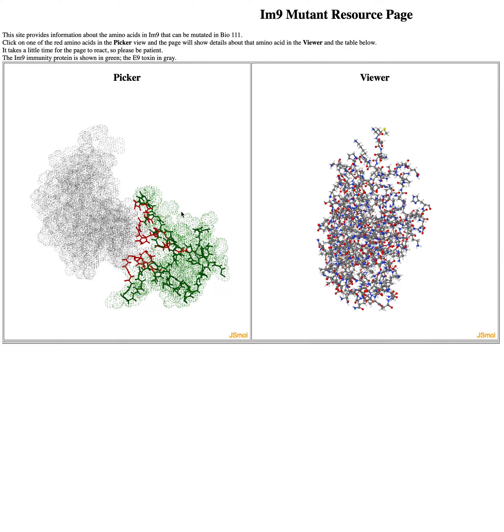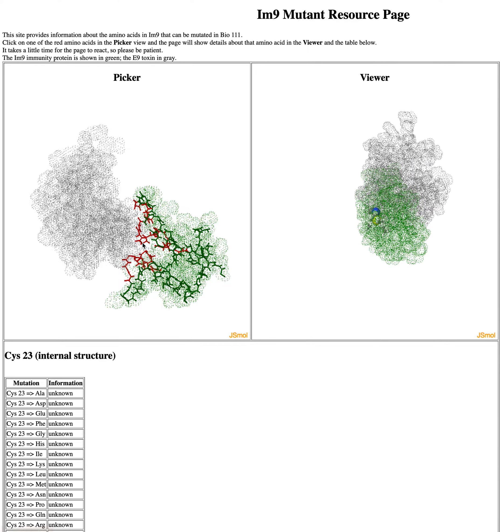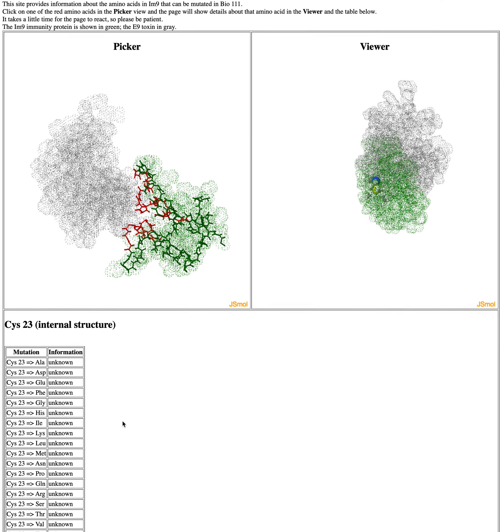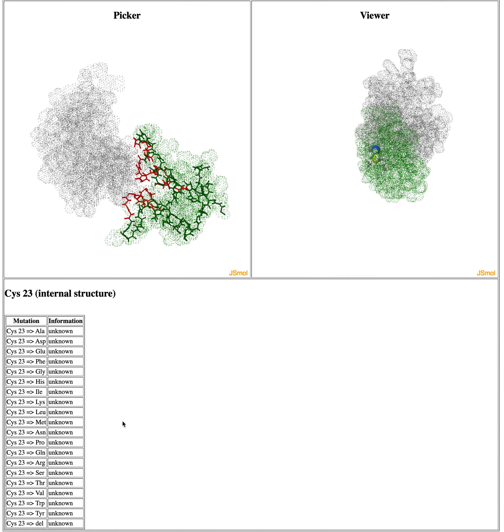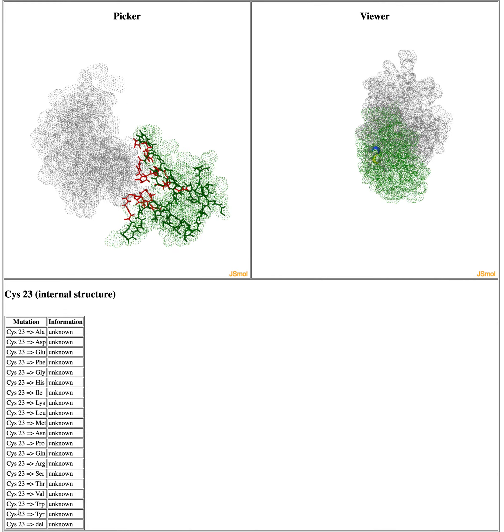What you can do is mouse over, and as you see here, this says cys23. That's cysteine at position 23, and it's red. If we click on that, it takes a second for the interface to respond. If you scroll down, you can see all the possible mutations we could have for cys23.